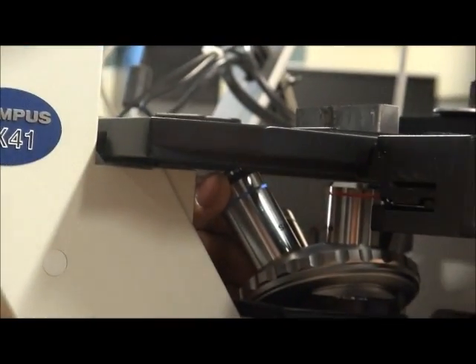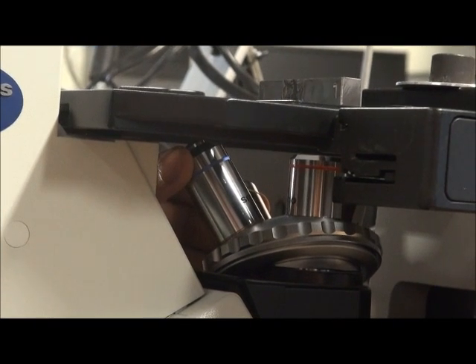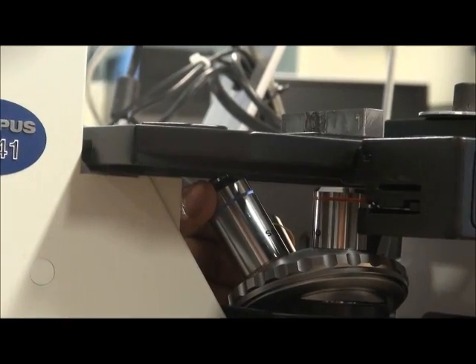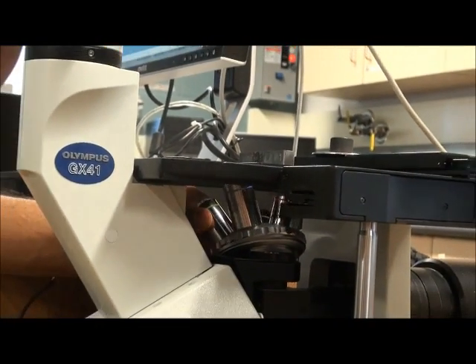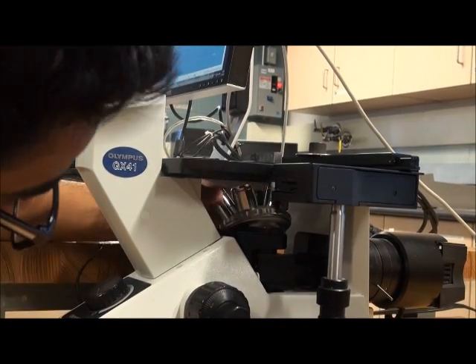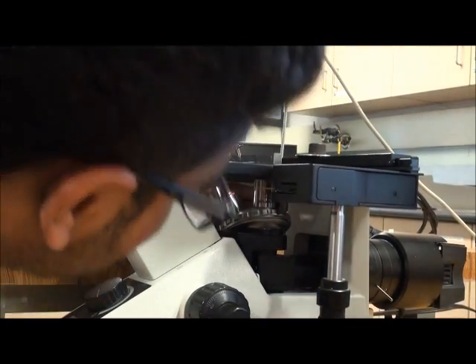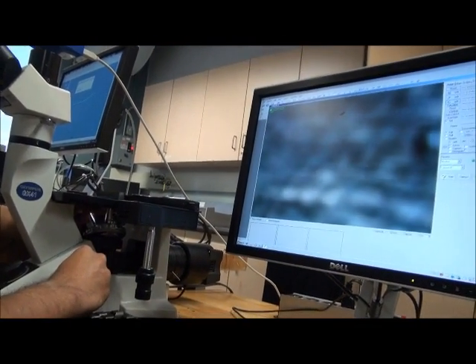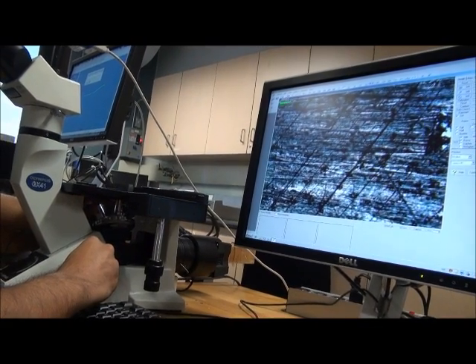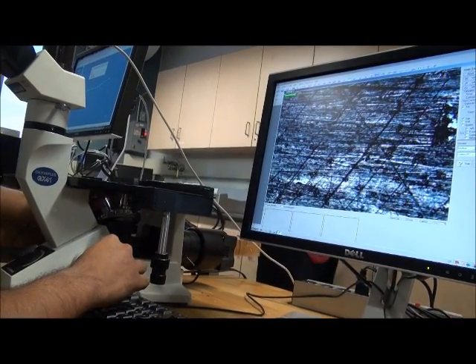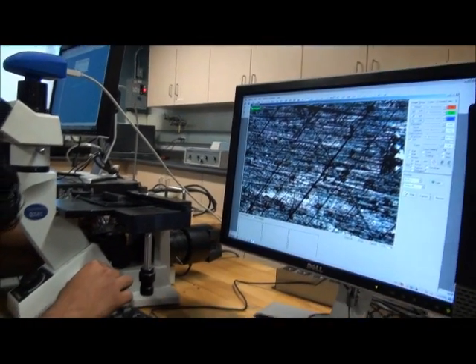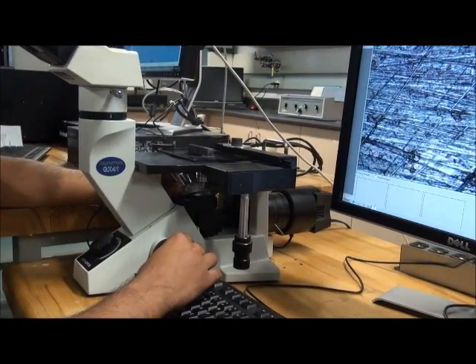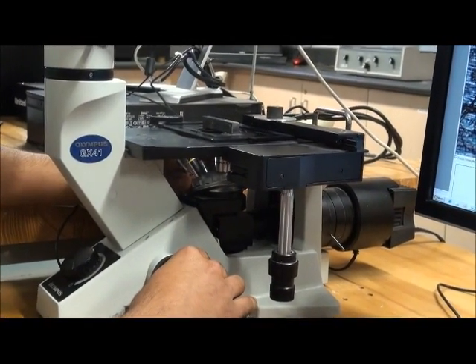I have 10x, 20x, 50x and I have to choose which one best suits for the maximum features. First, if you move to the 10x lens, look at this picture. And if you move for the further power lens that is 20x, you get this one.